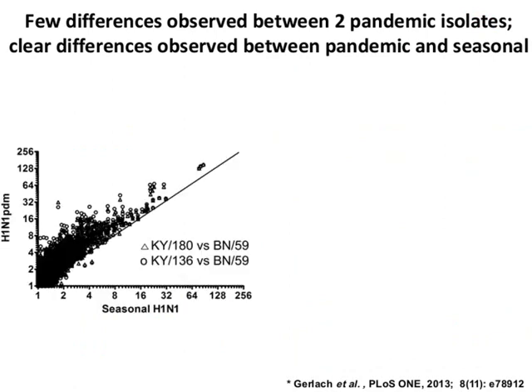Our next objective was to use microarray to evaluate the gene expression patterns in infected tissues and evaluate whether we could pinpoint differences between viruses to specific intracellular pathways. The microarray data from the isolates were normalized to mock-infected wells and filtered using a 2-fold and a p-value of less than 0.05 cutoff. Interestingly, we saw very few differences between our Kentucky isolates.